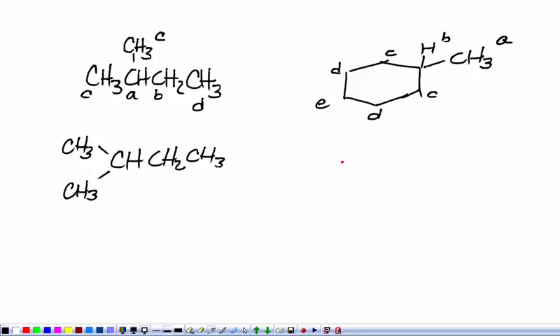There's not going to be any peaks between 7 and 8, because 7 and 8 is a benzene ring. And a benzene ring has the alternating double bonds or the circle in it. This is just cyclohexane. So for cyclohexane, these chemical shifts are probably going to be between 1 and 2, or 1 and 2.5. Okay? So that deals with the 7-8 issue.